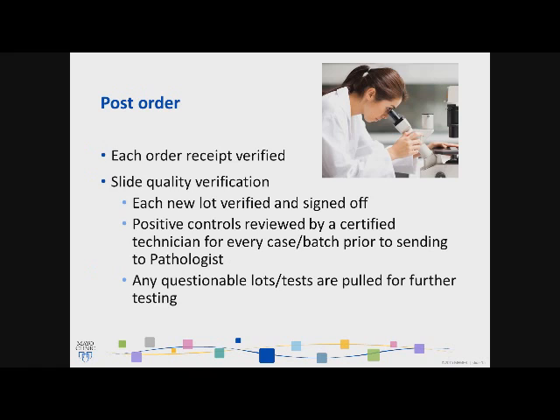And then we have our post orders. Some immunostains and special stains are ordered up front. Others are ordered on the back side. Again, like I told you, with my first job right out of college, I performed all immunostains and special stains by hand with a timer and marking a little line around each slide. I performed all these stains, and while it was frustrating, I think I learned a lot. Understanding that made me a better technician, but with automation, it's come a long way. Repeating any ancillary puts us at increased risk for losing patient tissue, so we definitely do not want to do that.